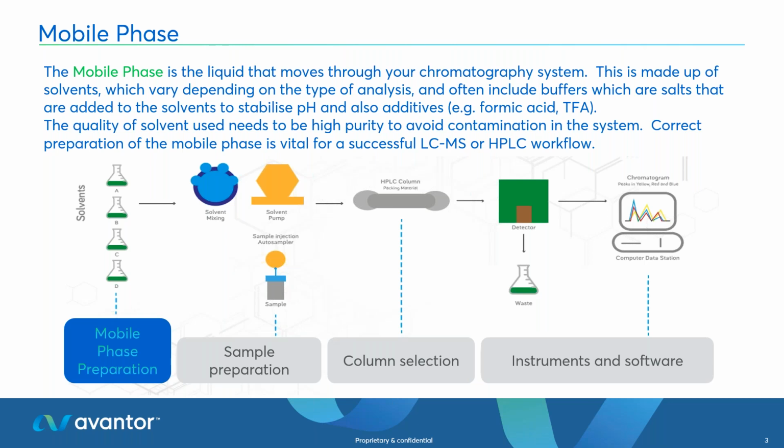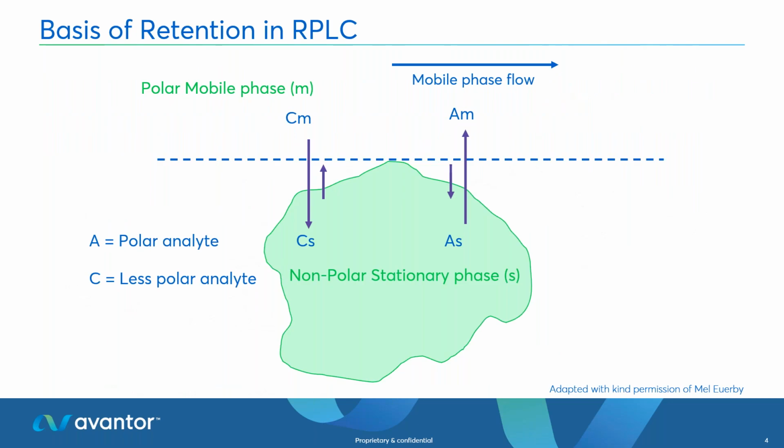So if we think about our chromatography, our liquid chromatography specifically, we have the mobile phase, which is the liquid moving through our chromatography system. So this is the part that moves, it carries your analytes through the whole workflow, as you can see on the screen. And if you were present at my last webinar, you will have been familiar with this sort of graphic of how chromatography works, and specifically reverse phase chromatography. So most of what we're going to talk about today concentrates on reverse phase.